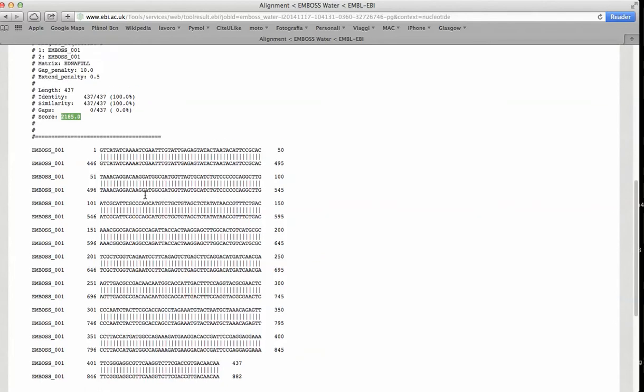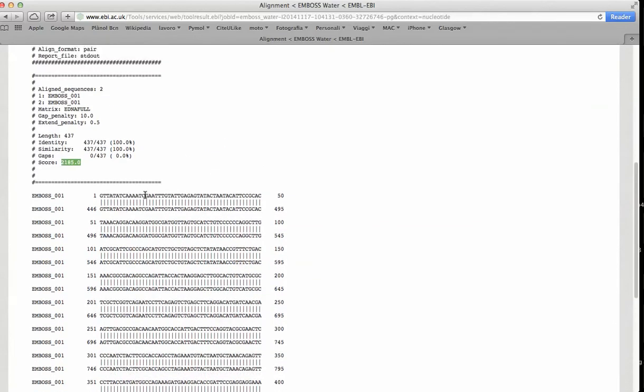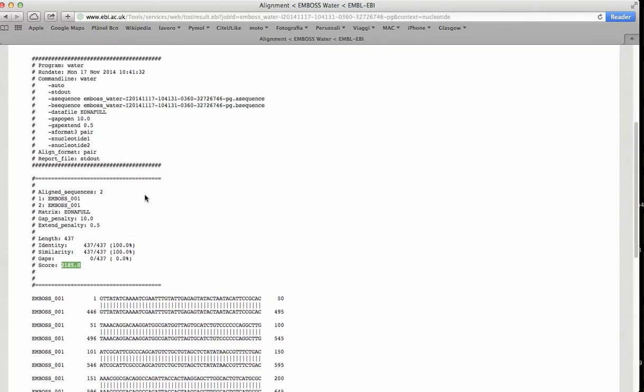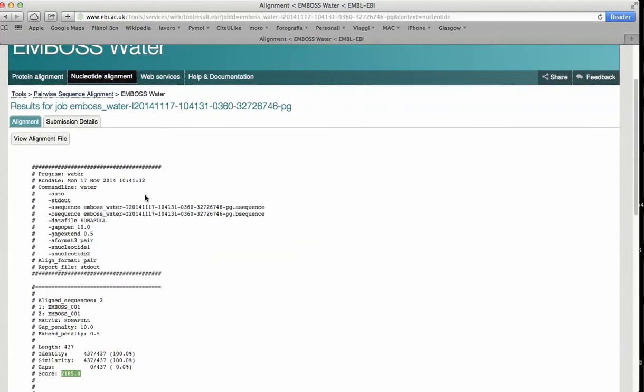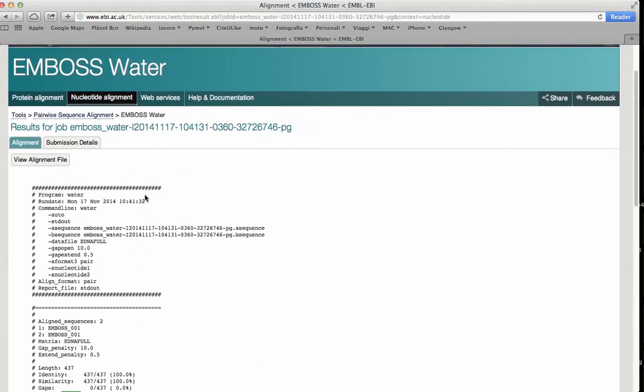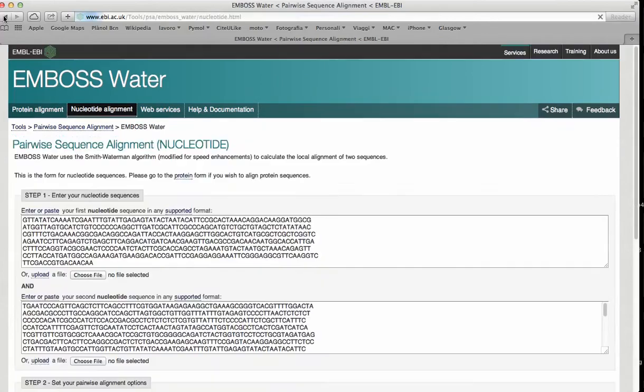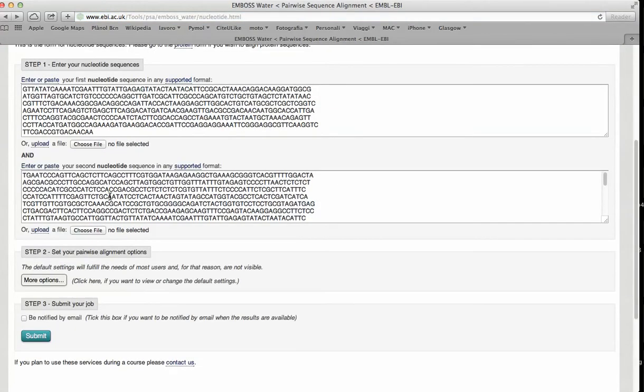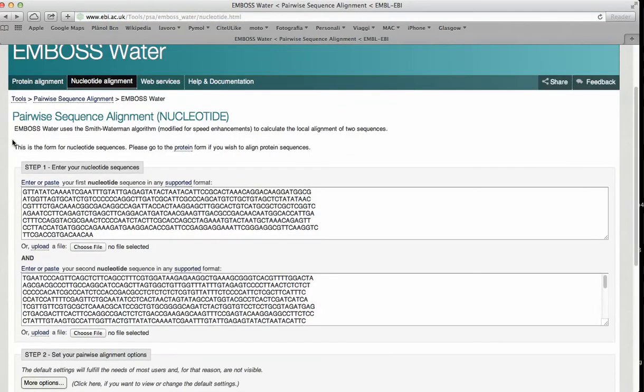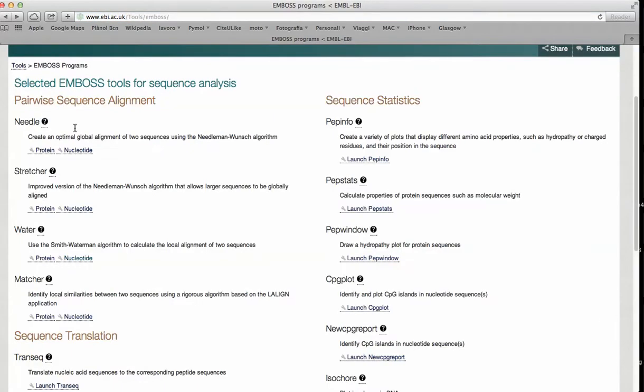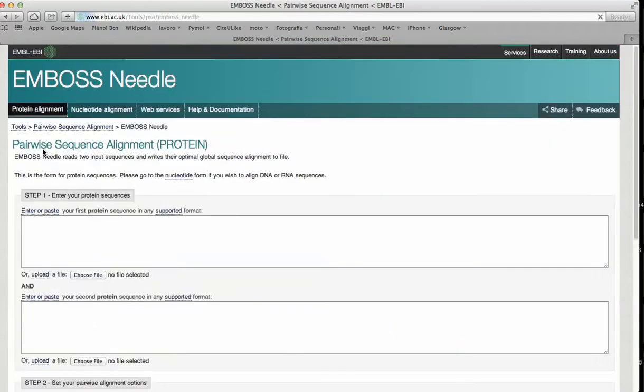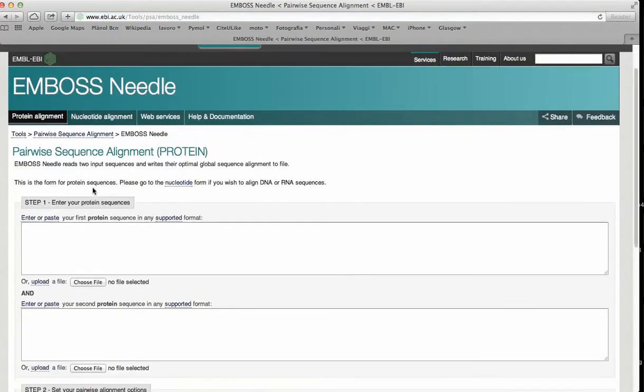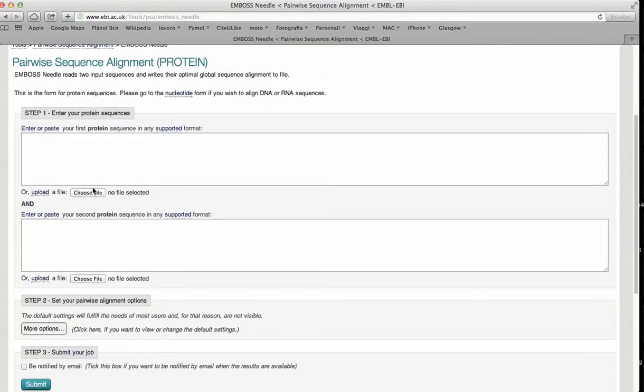Let's see another example in protein sequences using global alignment.